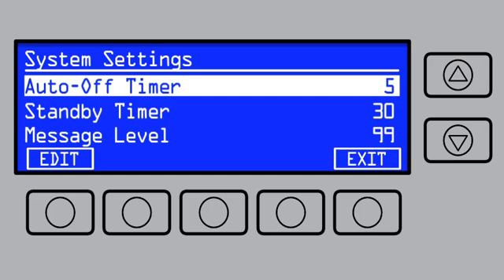Auto-off can be set to a time period between 1 and 999 minutes for the DL, HC, and HL lamps to change to the FL1 lamp. Set it to 0 if you don't want the lamp change.